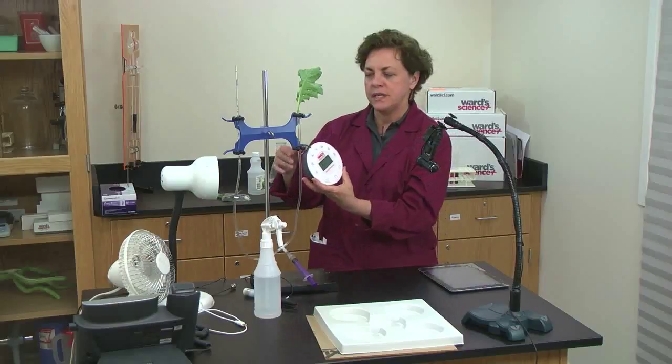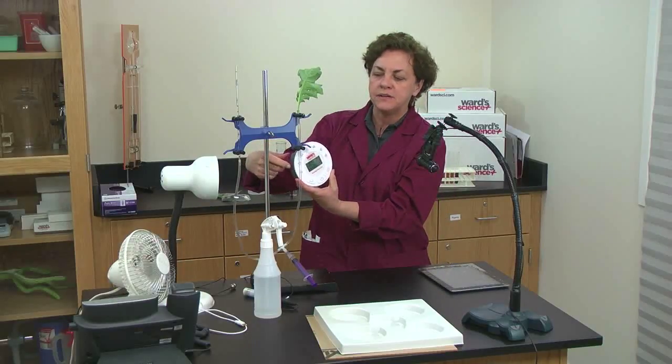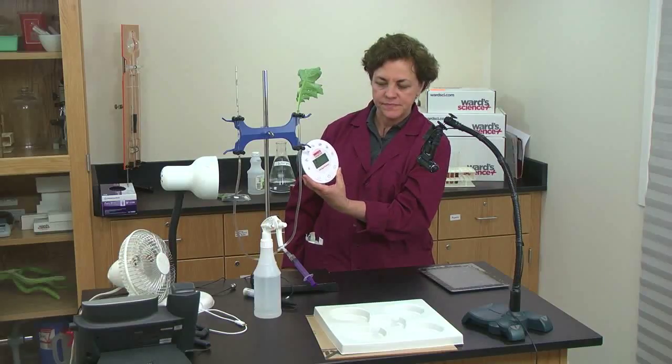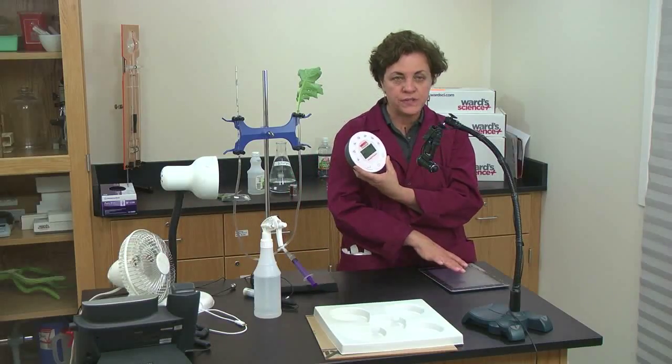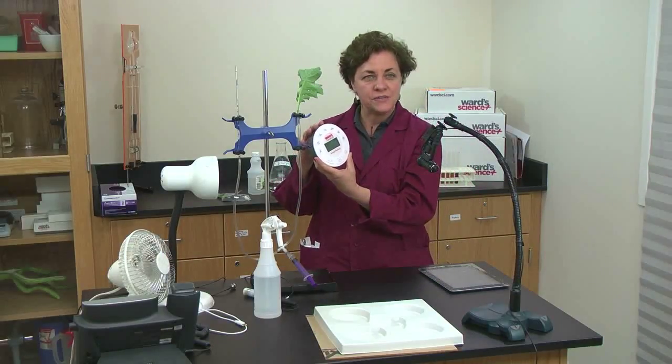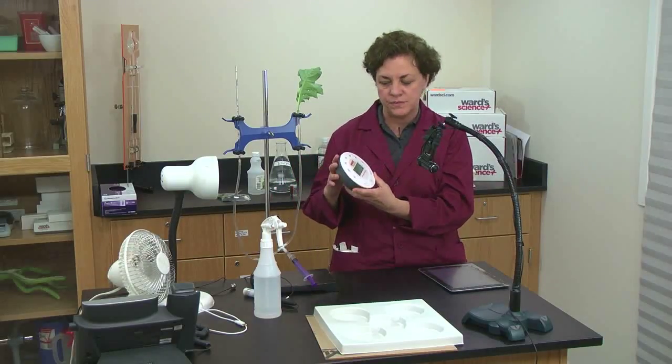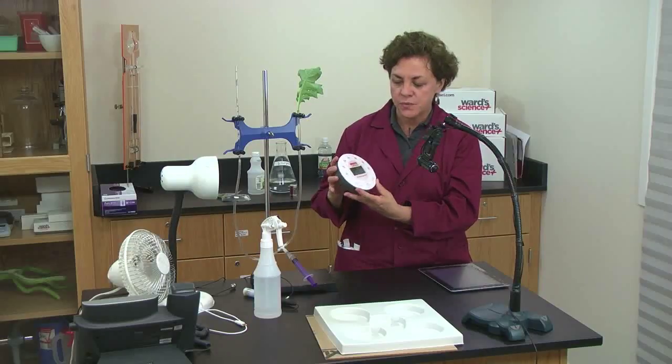Like I said, you could hold on to a clamp here and then just bag the whole thing. It should be pretty easy to do. And because this is Bluetooth, even if this is in the bag and you think it's hard to read, it's actually reading it on the iPad for you.